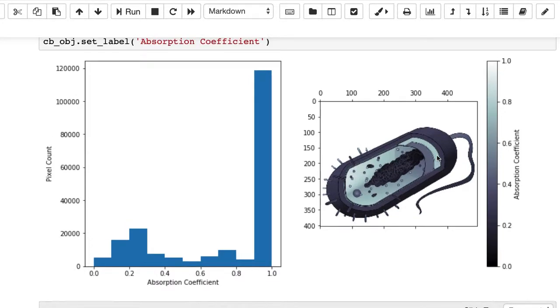And so in this class, we're going to focus primarily on things that you can quantify yourself, but that are very time-consuming to do. We're not going to focus on problems where you can't see it in the image yourself. For example, if you wanted to figure out how many cilia are on the backside of the cell, that's not something we can see ourselves.